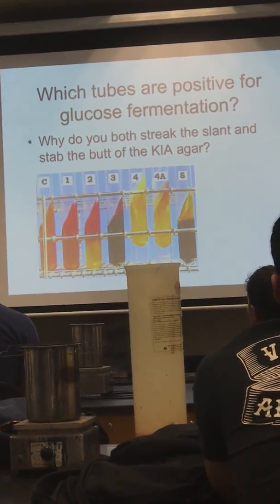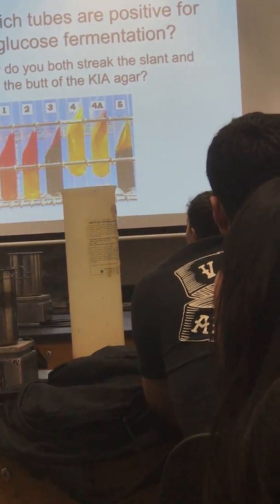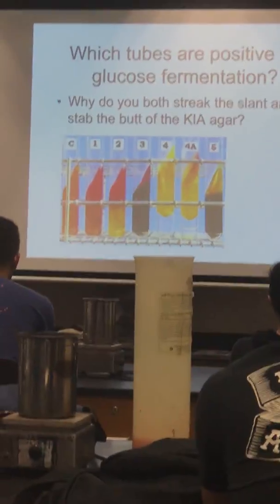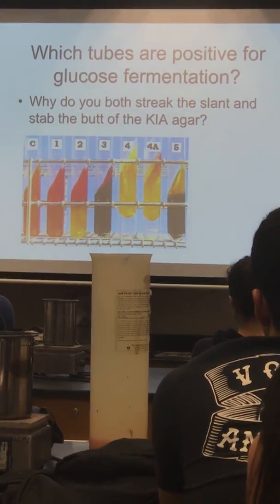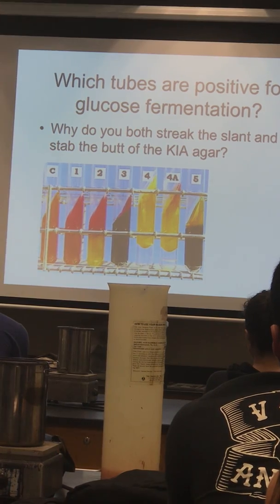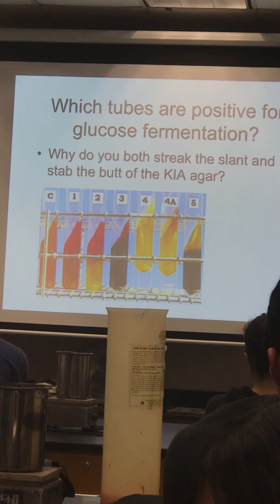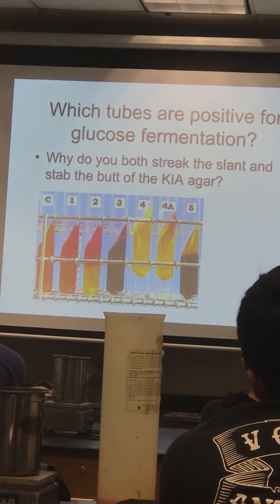There is a reduced amount of glucose present. If you read it too early, it'll look all yellow and you'll think, okay, fine, it's used everything. When it runs out of the glucose, if it can use the lactose, it'll turn on those genes, right? And there's a lot more lactose than glucose. So then it'll use the lactose and again have the pH low through lactose fermentation, and it'll be yellow throughout.